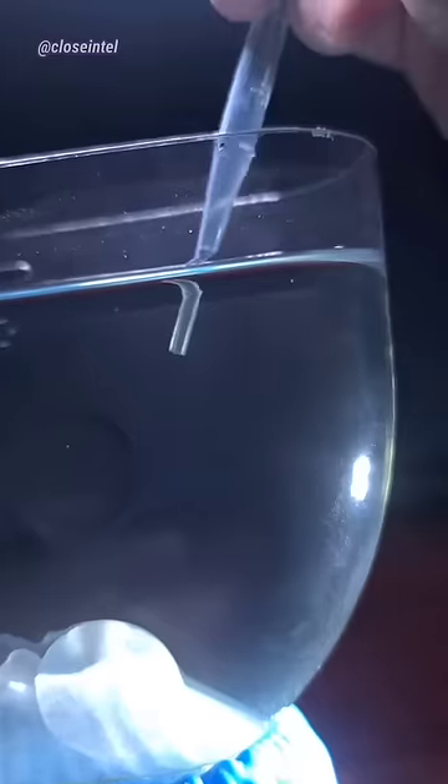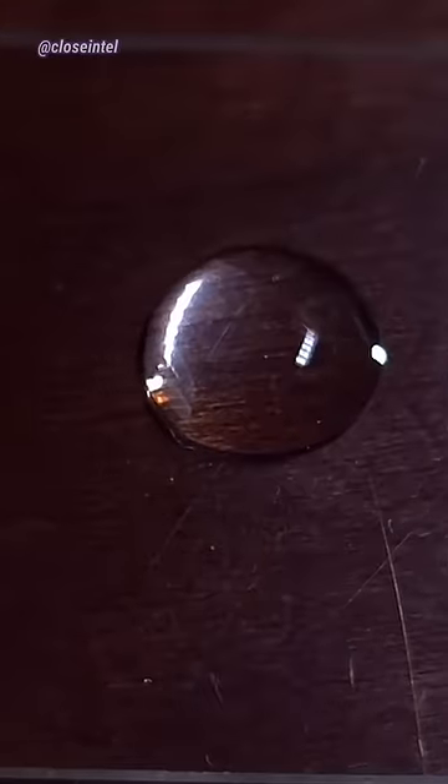Let's see what they look like under the microscope. They're still babies at the moment and they're only about a millimeter in length. They get their name from their long bodies and tail as an adult that resembles a monkey's tail.